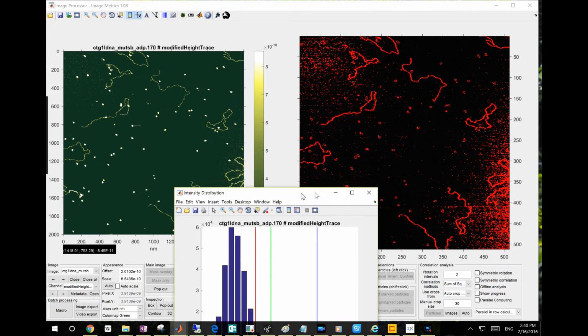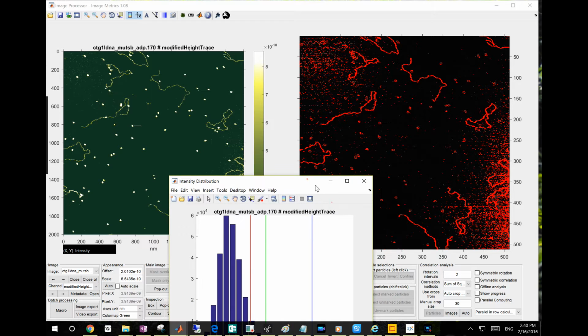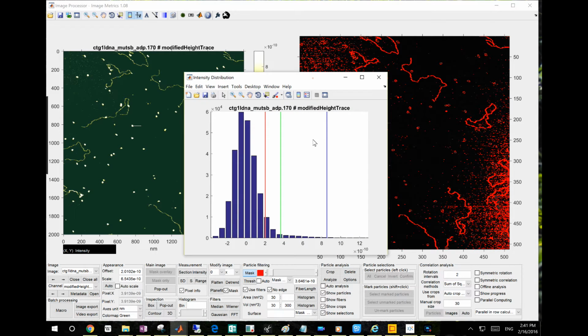Now you see anything that's below this height is masked, like the background, right? It's excluded, and anything above that data range, such as these proteins, which are higher than the blue bar, is not. That's why you see the proteins as a kind of halo circle. They're not completely masked, only the perimeters of them. So this could be useful for some analysis.